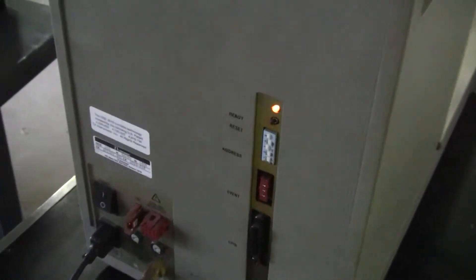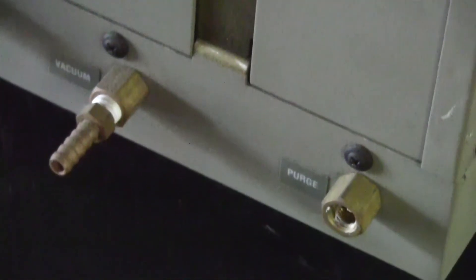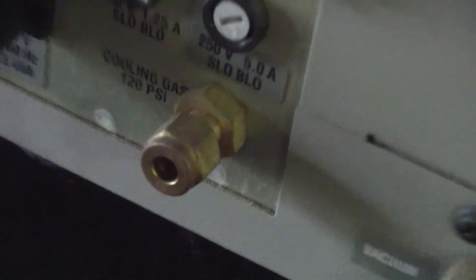Ready light is on in the back. Address set. GPI-V connection, vacuum purge, cooling accessory, gas, and your cooling gas.